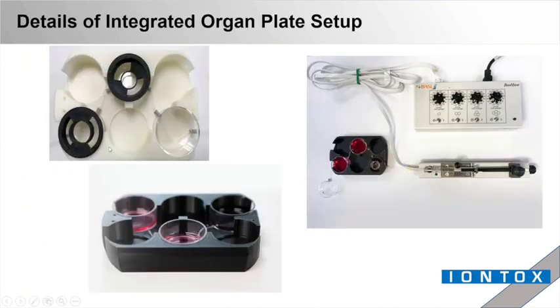So here's a couple more photos of the setup. And here, this is our pump set up with a syringe, pushing the perfusate through. Here we have an intestinal tissue, so the perfusate goes through here into the intestine, and here we have a third cup, which could be kidney or any other organ of interest, and then we would collect the perfusate here.